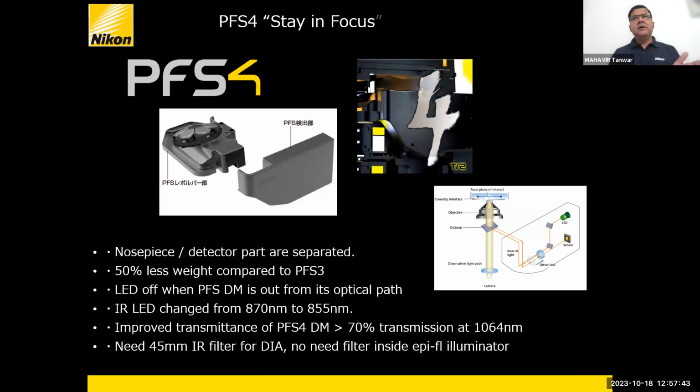These days, confocals also come with, of course, because confocals are not just for capturing beautiful pictures, they are also being used for time-lapse imaging, live imaging, long-term live imaging. Now, the biggest problem with long-term live imaging is that focus gets drifted with time. Let's say you have set up an experiment for 24 hours, or maybe a few hours, 2 hours, 3 hours, whatever time you want. What will happen? The focus will get drifted with time, and that will happen because of two reasons.